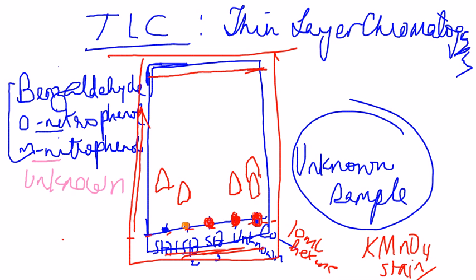Well, how do you read that information? Realize that the co-spot is supposed to contain all four of these, and so that is the reason that you're seeing what you're seeing. The unknown in this case tells you that you have a mixture, because you have one component and you have a second component, and it also tells you that it's probably standard 2 and standard 3, so it's a mixture of two things. So the aim is to identify how many components you have and which ones they are. You could have, like I said, only a one component system, or a two component, or even a three component system, and that's what you have to figure out.